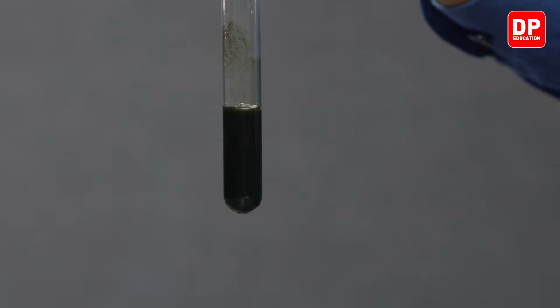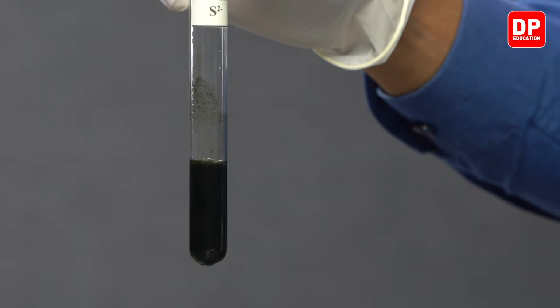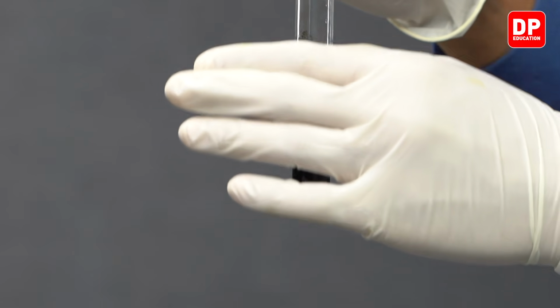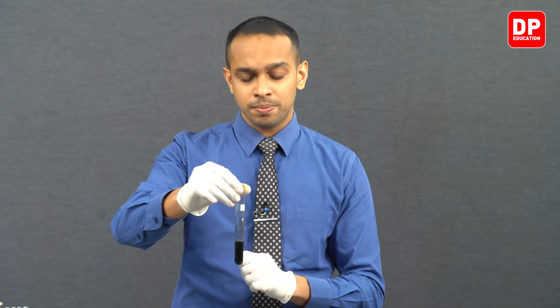So now you can see very clearly what we have formed here is a black color precipitate, and the black color cupric sulfide precipitate is now dispersed throughout this aqueous medium and has formed a suspension. If you allow it to stand for a while, you will see the black color cupric sulfide precipitate will collect at the bottom, and you can very clearly observe the black color precipitate. So what we have formed here is cupric sulfide, which is a black color water insoluble precipitate. So this test can be used to identify the presence of sulfide ions.